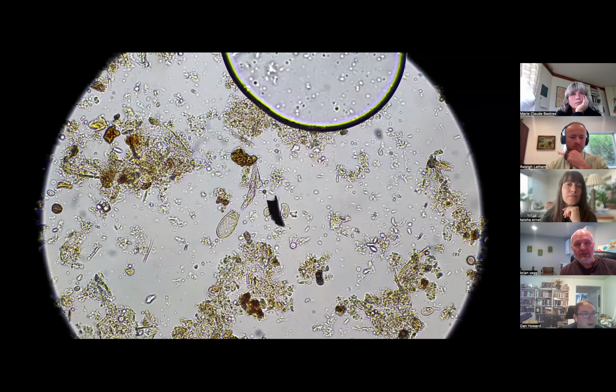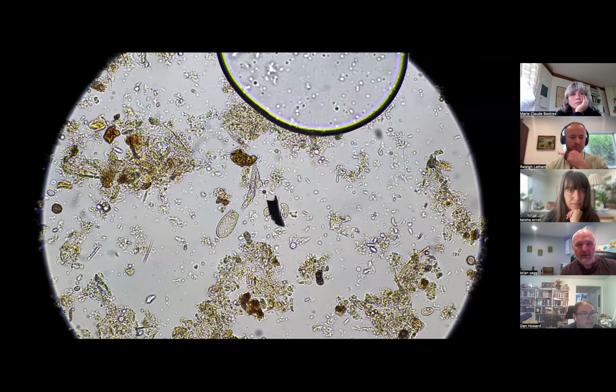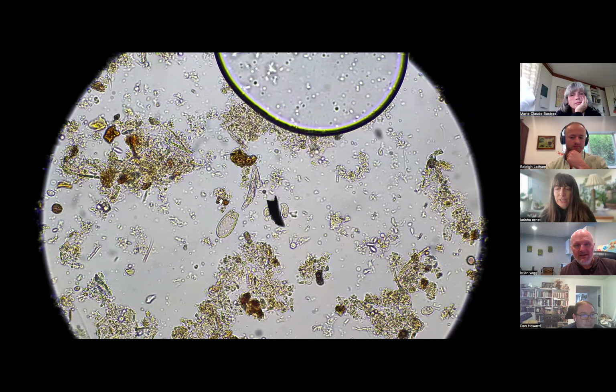You can see through here, I've actually got quite a bit of fungi in this particular sample. Look at that testate amoeba. Isn't that pretty? Is there anything you don't use, Brian?